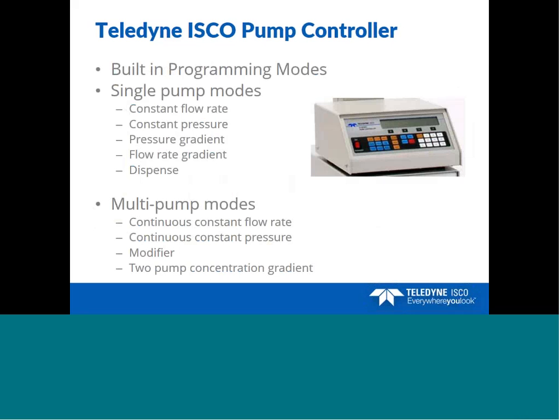For dual pump, multi-pump modes, you have continuous constant flow rate or continuous constant pressure, and in these modes, one pump will automatically refill while the other one is delivering. We have a modifier mode, and we have a 2-pump concentration gradient mode.